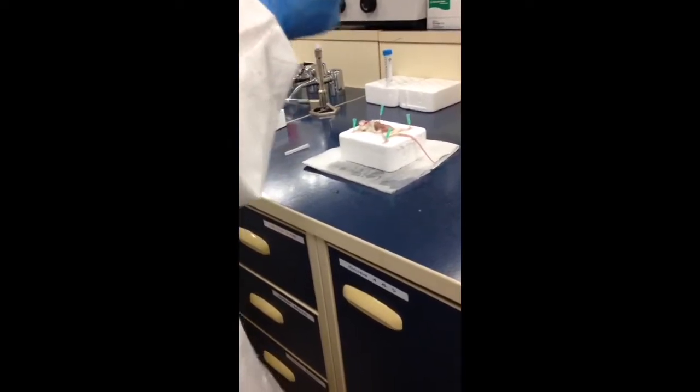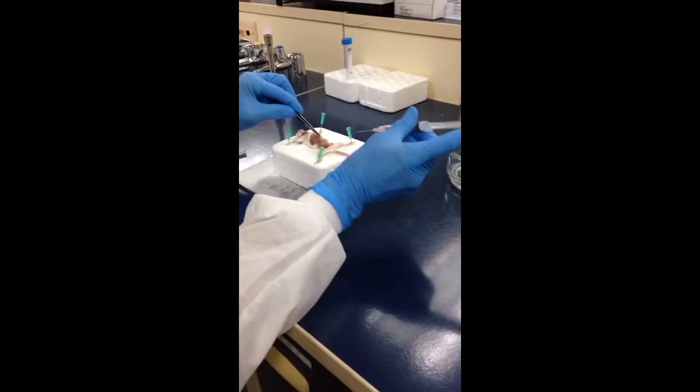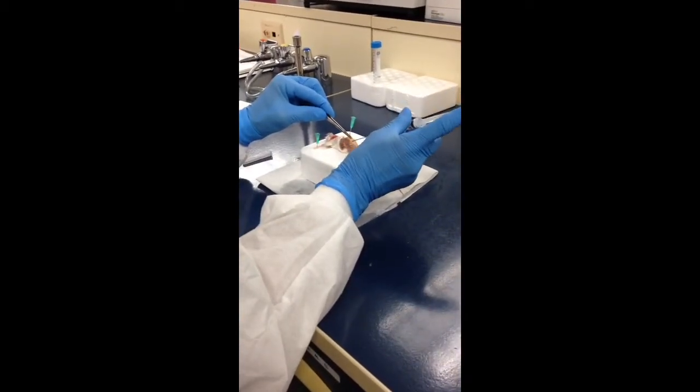What you want to make sure you always do is keep everything sterile. I'm going to flame that, and what I want to do is pick up the skin and just go into this area.